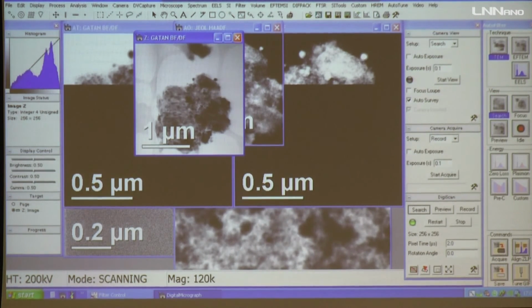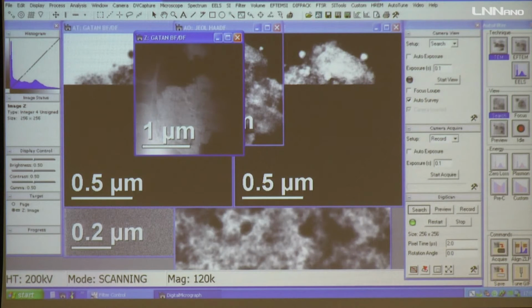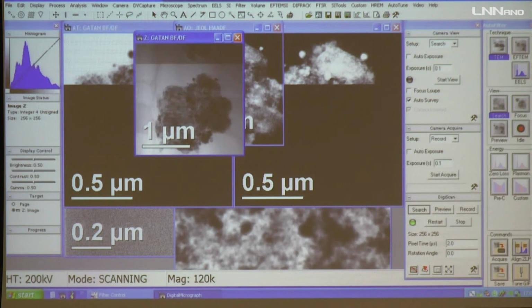When I move the beam, the particles start to be bright, okay? But for sure, it is not the correct operation of the machine. Then we just can see that it changes, but we cannot acquire an image in this forced configuration, okay?